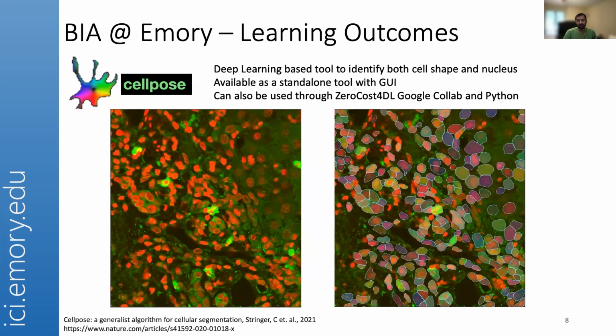Apart from that, we will be using Cellpose, which is a very bare minimum way of doing this. And again, the executable file that I propose for you to use will take you from step A to step B that you see over here. The beauty of that is that it gives you the data sets even if your staining is really terrible in the background.